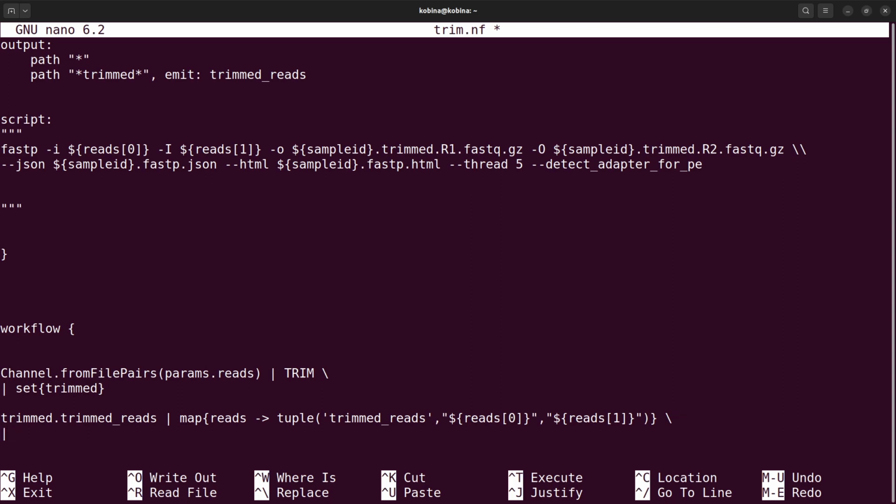Now we bring this and remove the next line, and I'll say pipe, and I'll say set, final trim. So when I set it, there's a channel, so I'm adding a new variable. I'm assigning it to a new variable that will now also contain this information. And I'm saying final trim because I have processed everything. I have my final information.